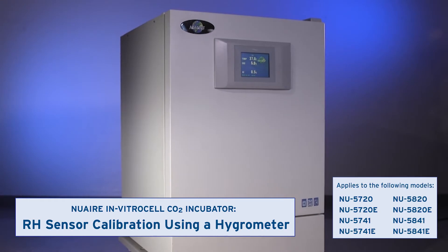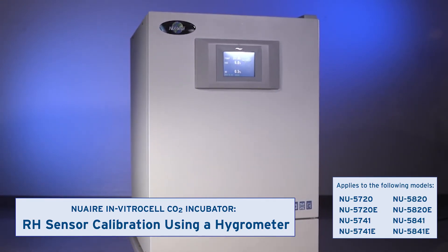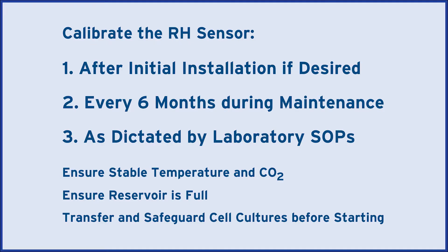This video shows how to calibrate the RH sensor in incubators with active humidity control by using a hygrometer. You may choose to calibrate it during installation and are advised to calibrate it every six months thereafter, or as dictated by laboratory policy.